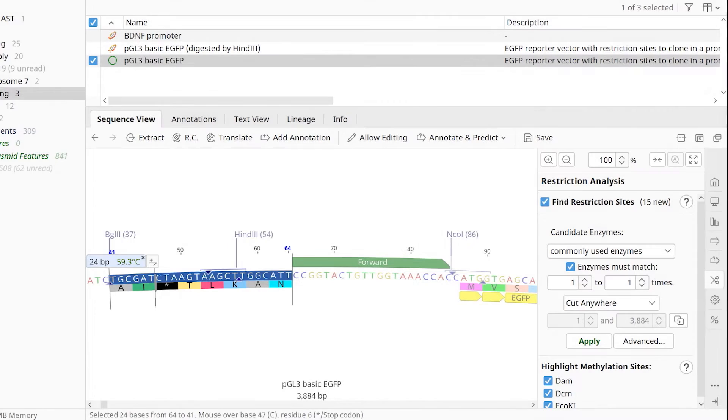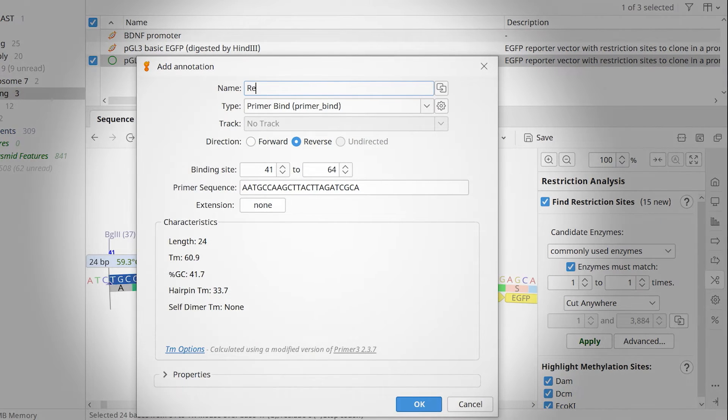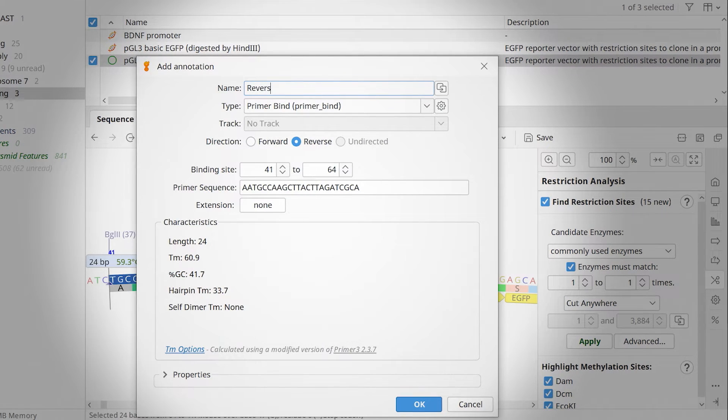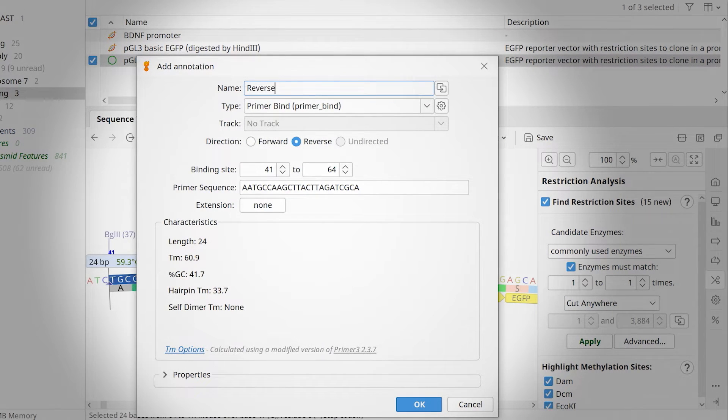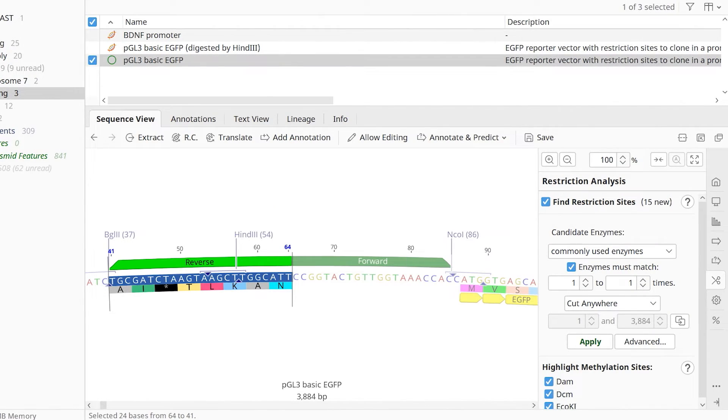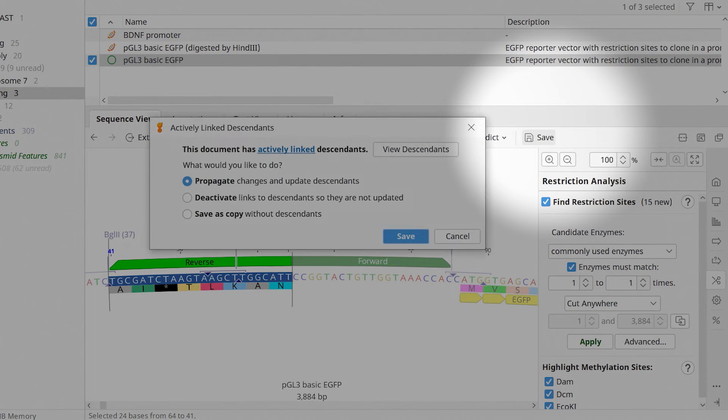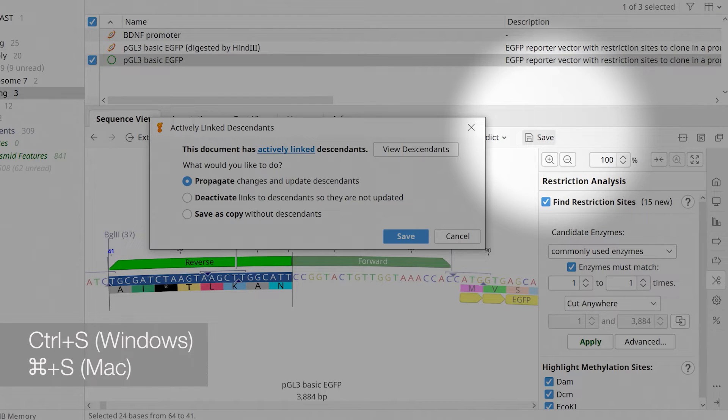As before, select Add Primer. Give the primer a name and this time ensure you select the reverse orientation. Before proceeding, make sure you save your file by selecting Save or use the keyboard shortcut.